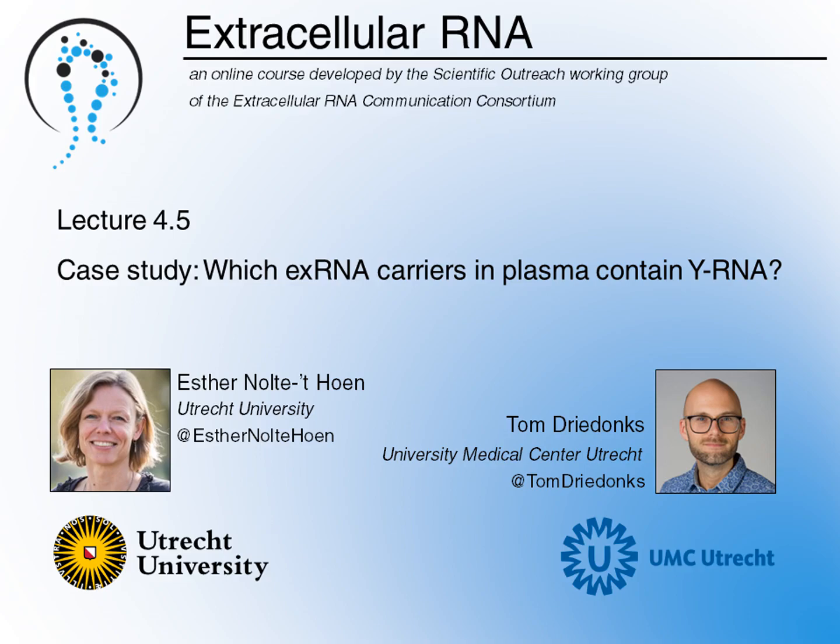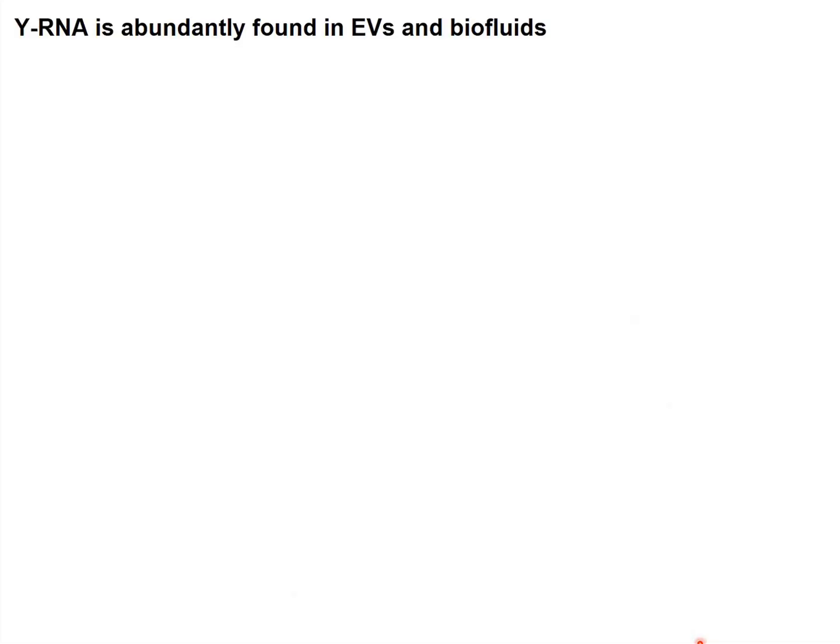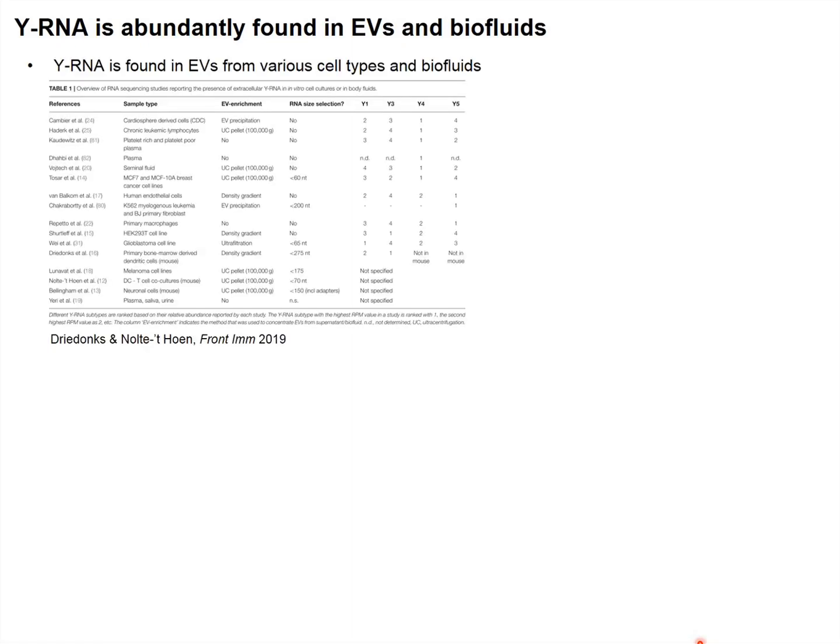In this lecture, we will explain how to determine in which extracellular RNA carrier your RNA of interest is found. We will illustrate this by showing data of our studies to identify the extracellular RNA carrier to which Y-RNA in plasma is associated. We have already discussed Y-RNA in our previous lecture, but we'll give you a quick refresher why this is such an interesting RNA molecule.